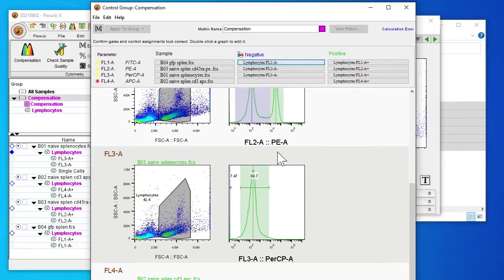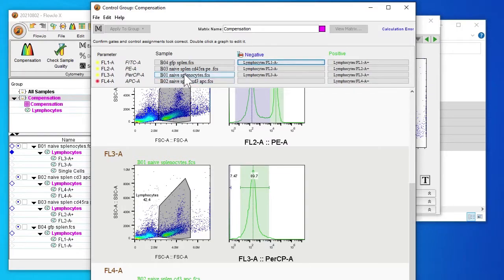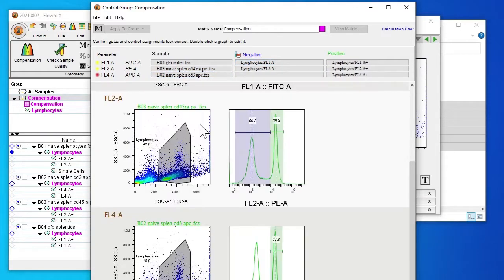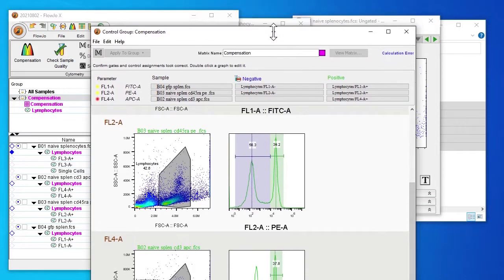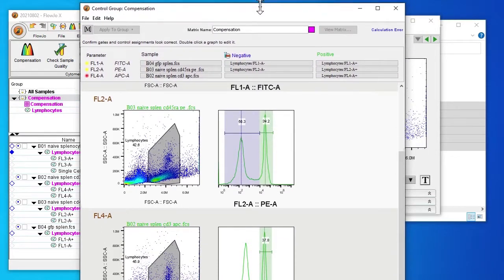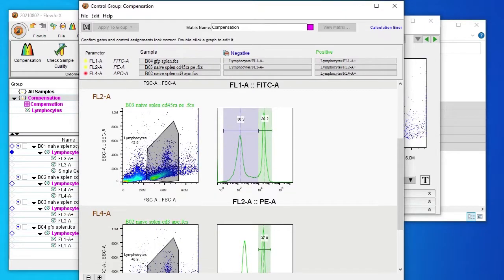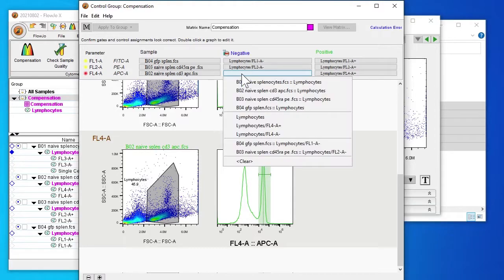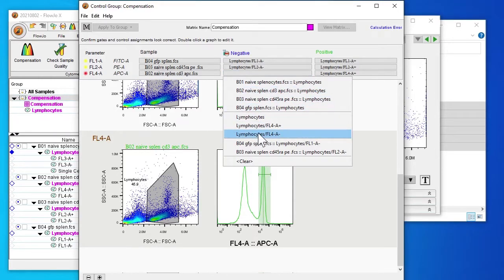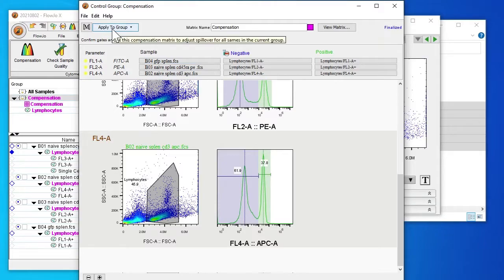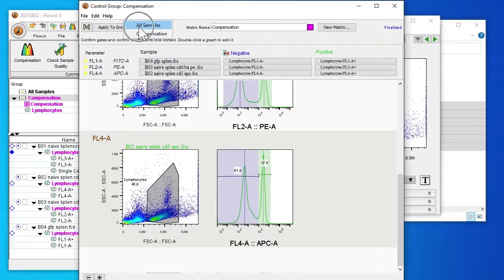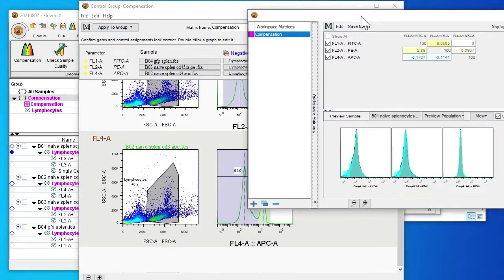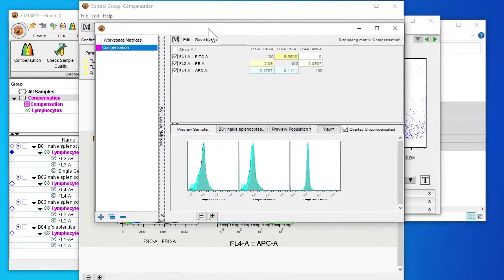As you can see we don't have a PerCP sample so I'm going to right click and remove this parameter. The negative hasn't been set yet for APC so I'm going to select FL4A minus. So now our parameters are all in yellow and now we can apply the cell group to all samples. We click view matrix. You can see the matrix for our compensation.